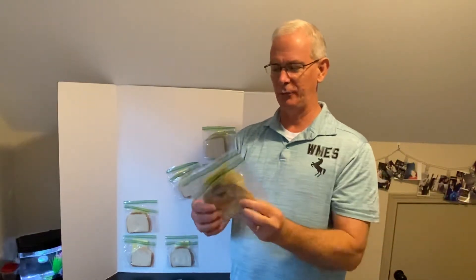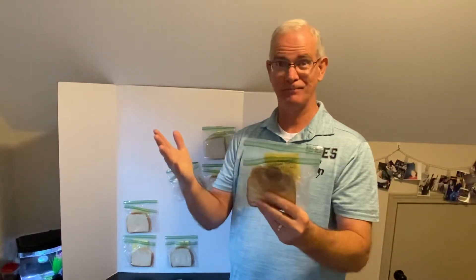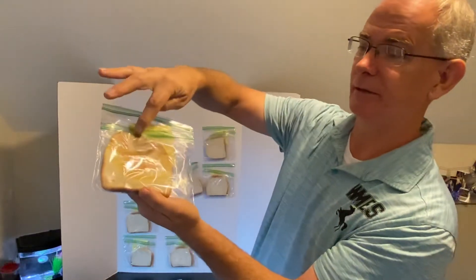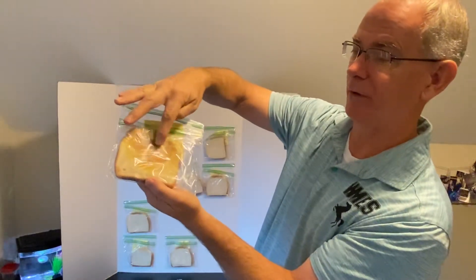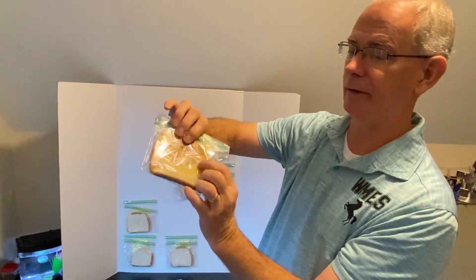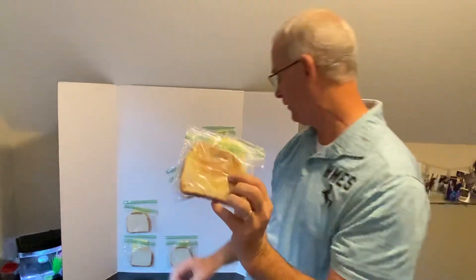Okay, so here was the first one we looked at — here's the white bread. The students in my class took the white bread, gloves on, and they rubbed it across a Chromebook, just one Chromebook. And that's what grew. Notice — check this out — look at how it looks like rings of growth. And also, you see the similarity here. That's a totally different bacteria growing there.